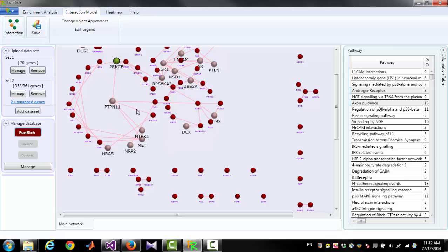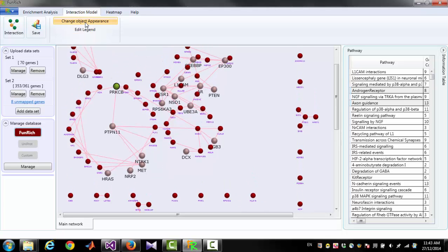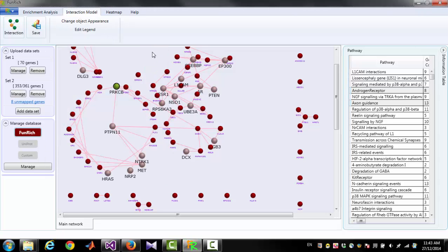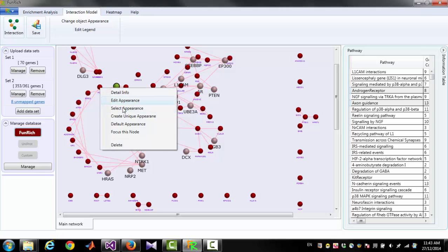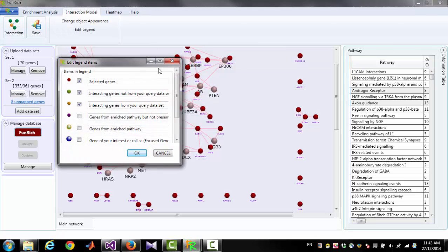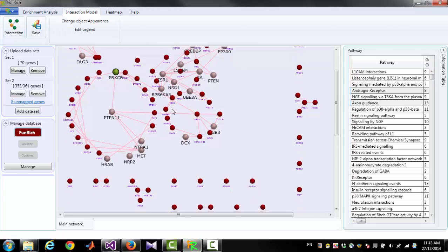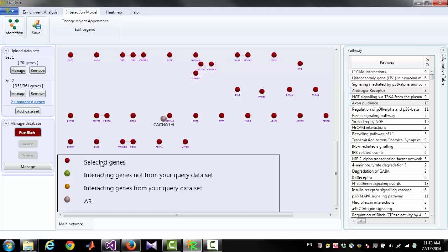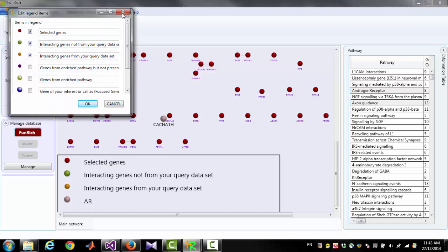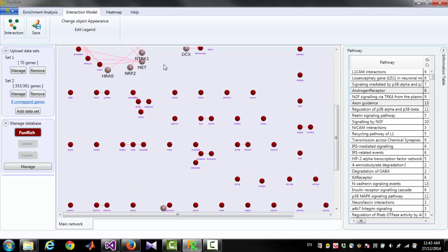One more thing: there are two extra buttons on the top. One is to change the object appearance — you can also change object appearance by clicking on a node. The other button is to edit the legend — you can also edit the legend by clicking on the legend. That's all for today. Thank you for listening. Have a good day.